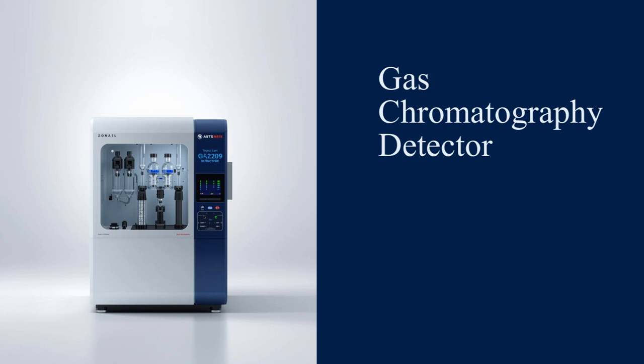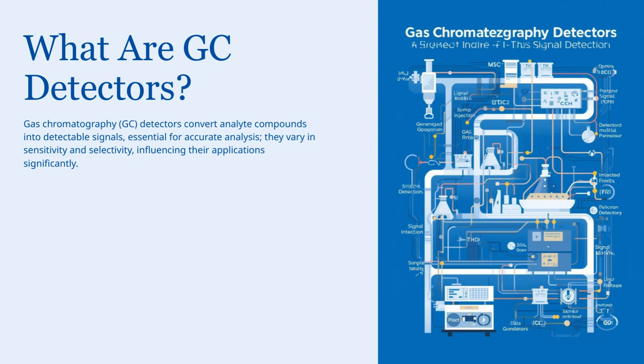So, understanding how the detector works and choosing the right one is key to obtaining accurate and reliable results in gas chromatography. Gas chromatography detectors play a crucial role in converting the analyte compounds into signals that we can actually detect and measure. Without these detectors, it would be nearly impossible to analyze the components separated by the GC.